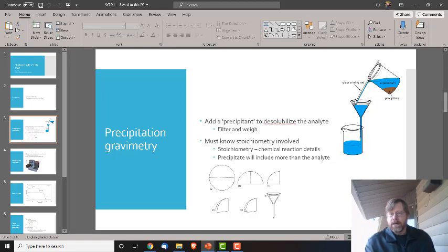The glass stirring rod goes across the top through the spout. You're going to have to get used to how to hold the beaker and keep the glass stirring rod in place. There's some technique involved, but that's going to help prevent drips and also splashing. If you're pouring carefully, the fluid will roll down the glass stirring rod and into the side of the funnel.